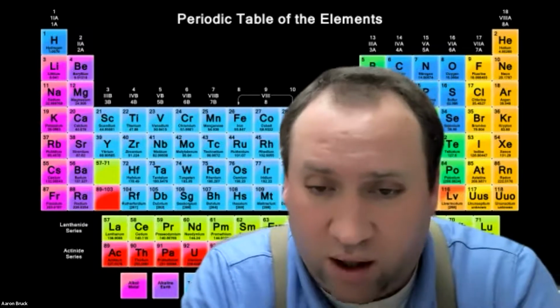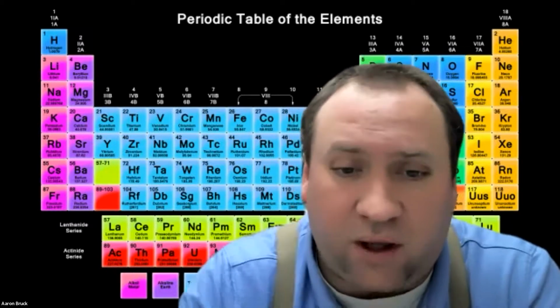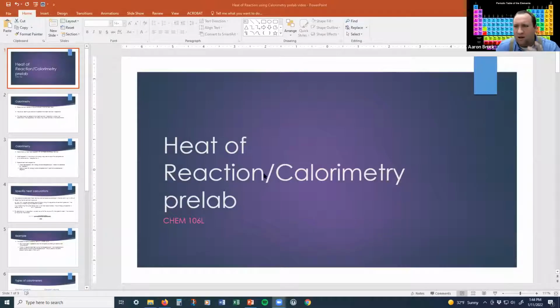This is the pre-lab video for the experiment called heat of reaction. This is a calorimetry experiment, and the purpose of this video is to go through what that is and get you ready for the pre-lab that is due in advance of that lab coming up. So let's take a look at what it is that we're talking about.